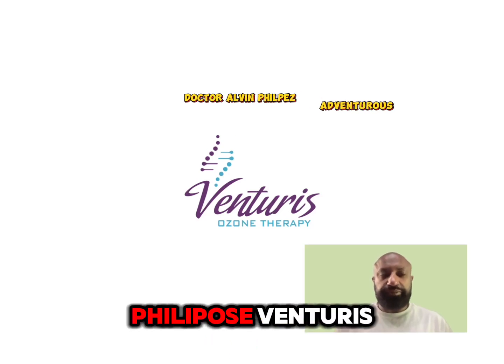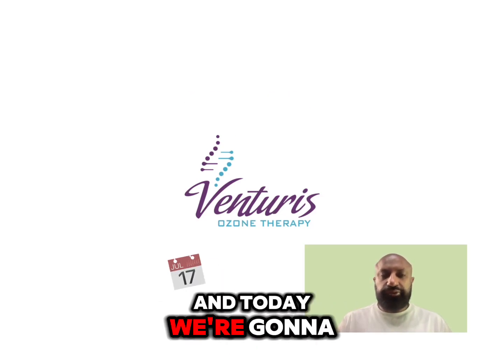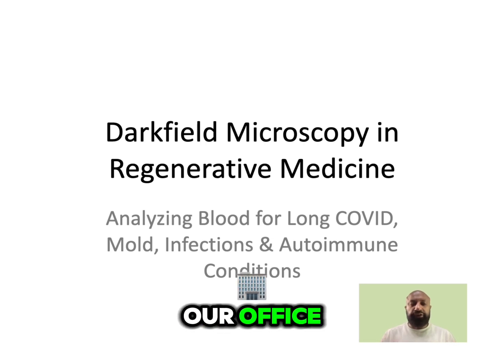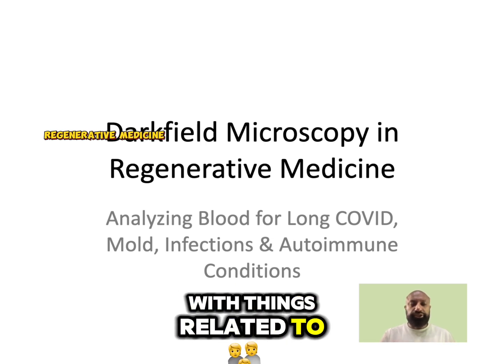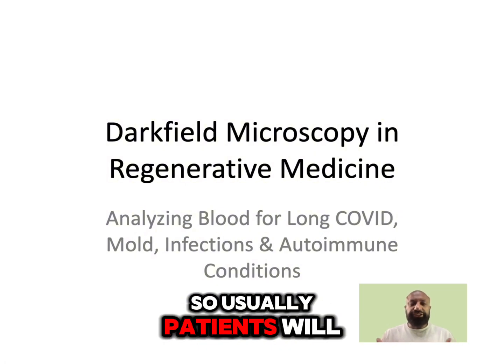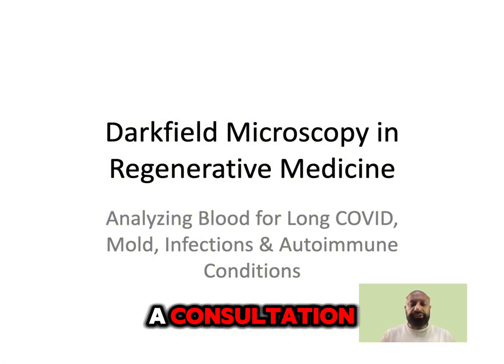This is Dr. Alvin Philippos at Venturis, and today we're going to be talking about Darkfield Microscopy and its use at our office with things related to regenerative medicine and autoimmune disorders. So, usually patients will come in when we're doing a consultation.